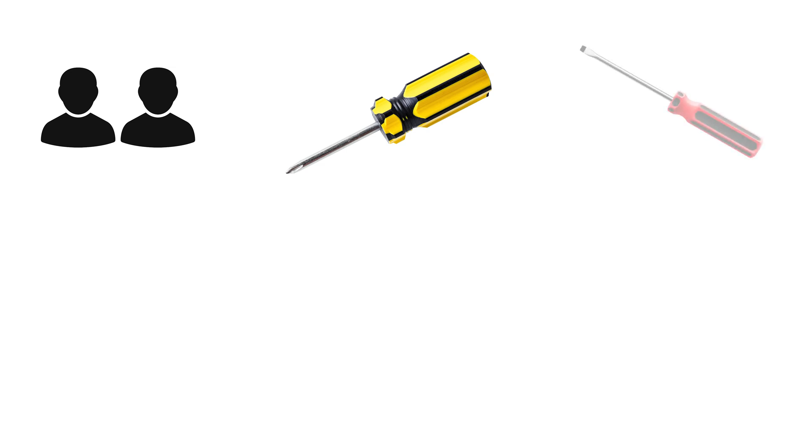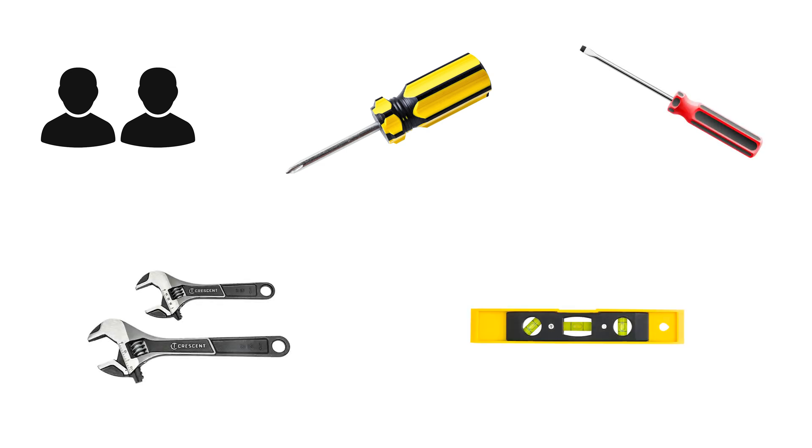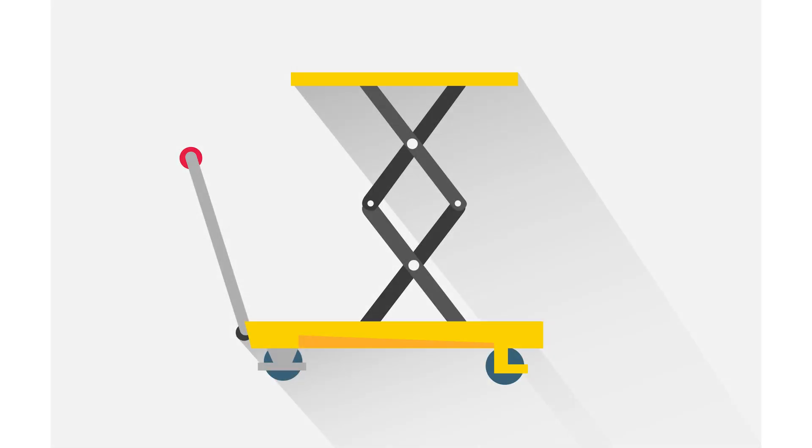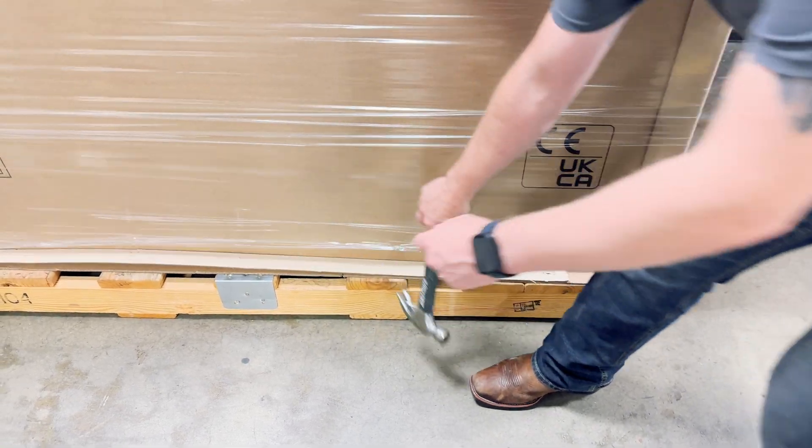You'll need a minimum of two people, a number two Phillips screwdriver, a flathead screwdriver, two adjustable wrenches, a level, and a hydraulic table. Begin by removing the exterior cardboard box from the BSC pallet.